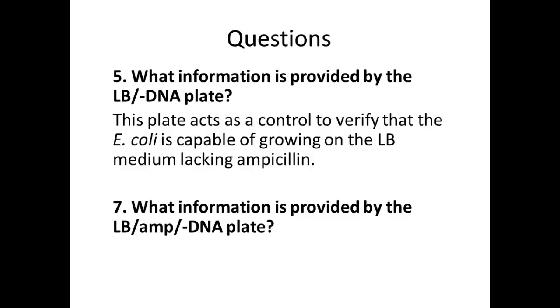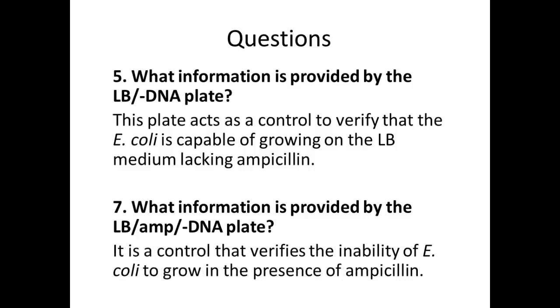Now the next plate, of course, is LB ampicillin DNA negative. So again, they don't have the DNA, they don't have the ampicillin resistance gene. But this plate contains ampicillin, so what's going to happen to these bacteria? They're going to die, right? And this is our control to tell you what? That ampicillin can kill the E. coli we started with, right? It verifies it can't grow in the presence of ampicillin.